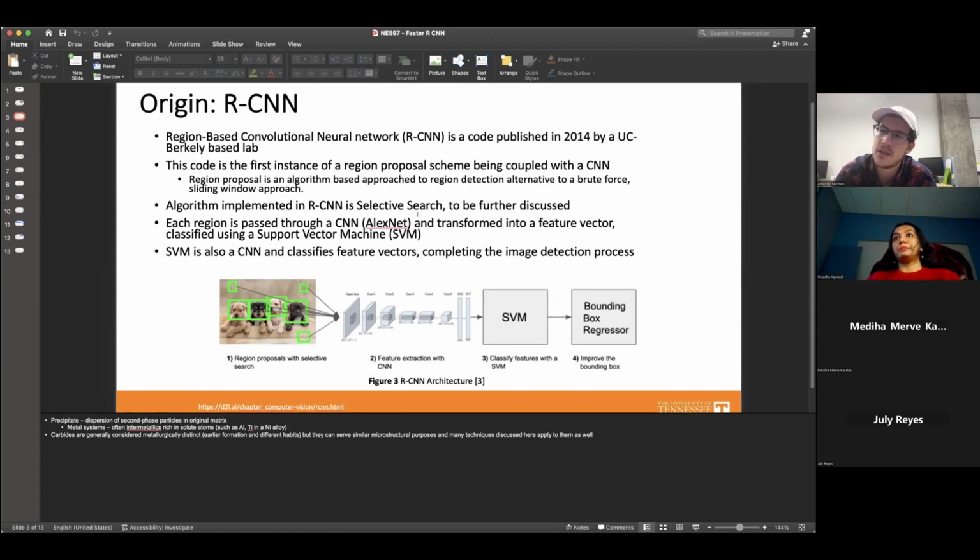Not exactly. In RCNN, the big problem with it is that you're using AlexNet, pretty often, and that's what does feature identification from an image. It operates as one isolated CNN, and the output of that is your feature vectors, but it doesn't tell you what those feature vectors are.